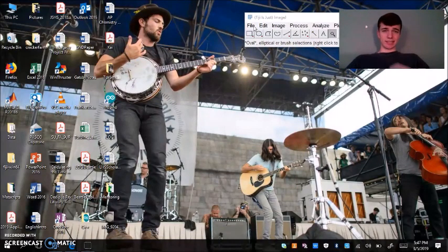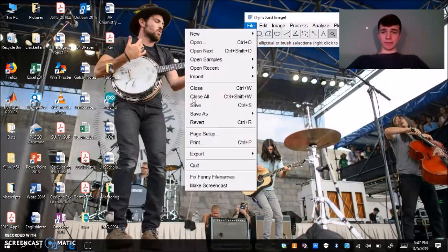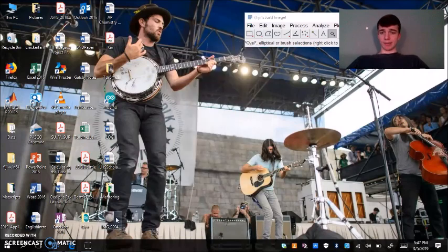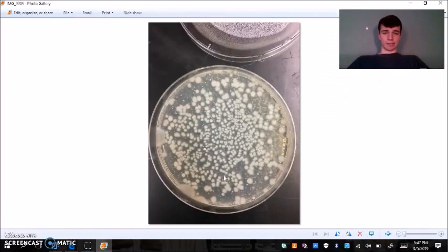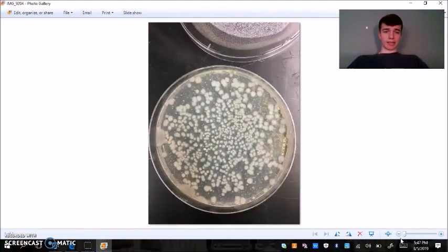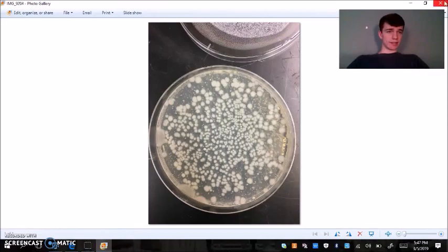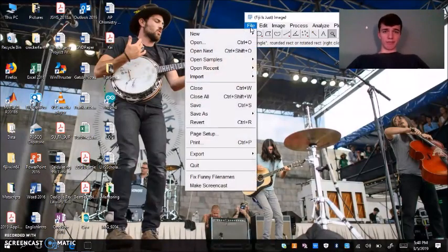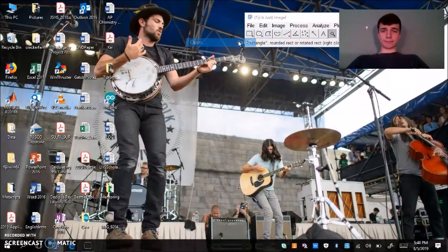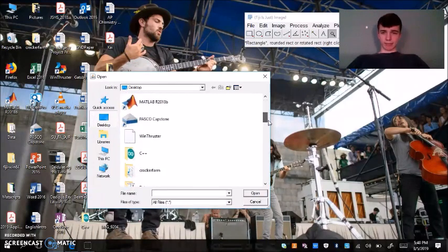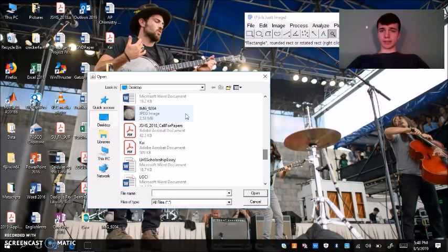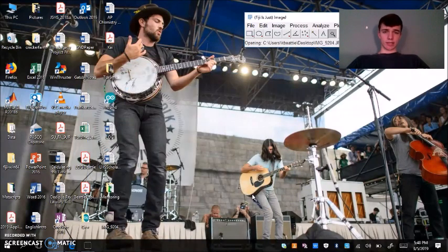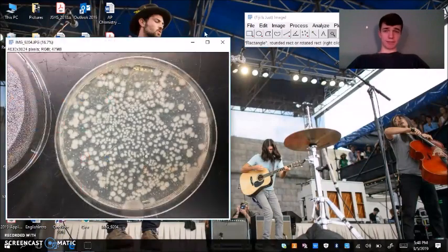The first step in the analysis is to open your image. I have my image here already on my desktop, it is my E. coli colony picture on an agar plate. We're going to hit file open, it's on our desktop, we're going to find it really quickly, and we're going to open it using ImageJ.